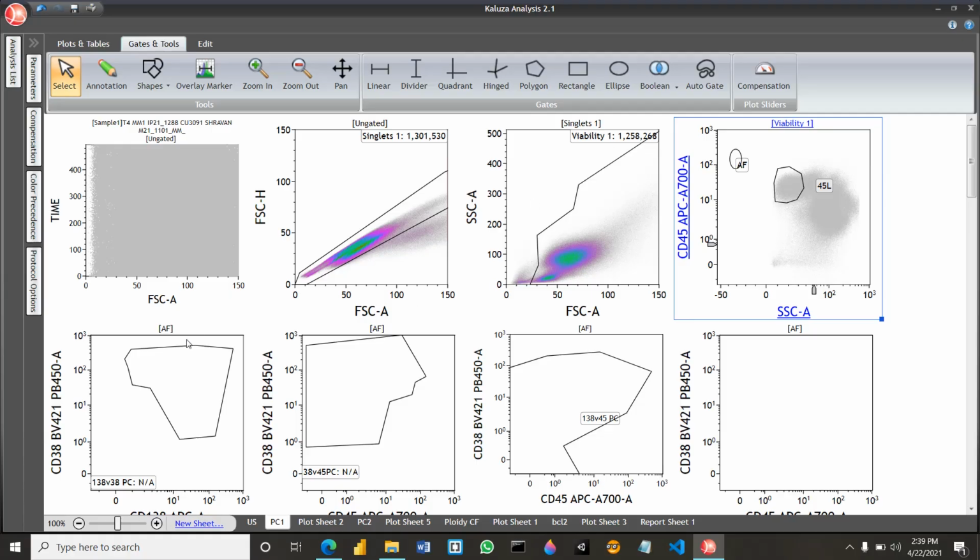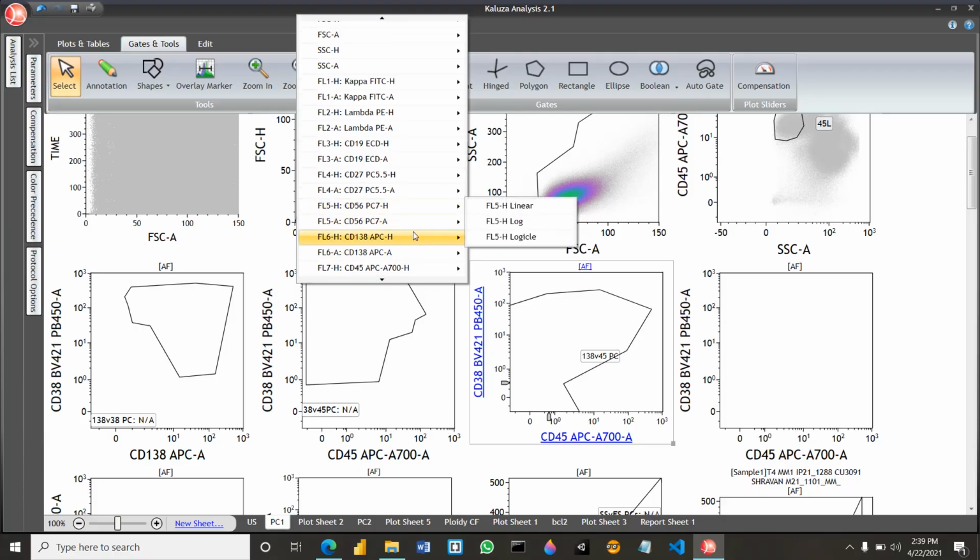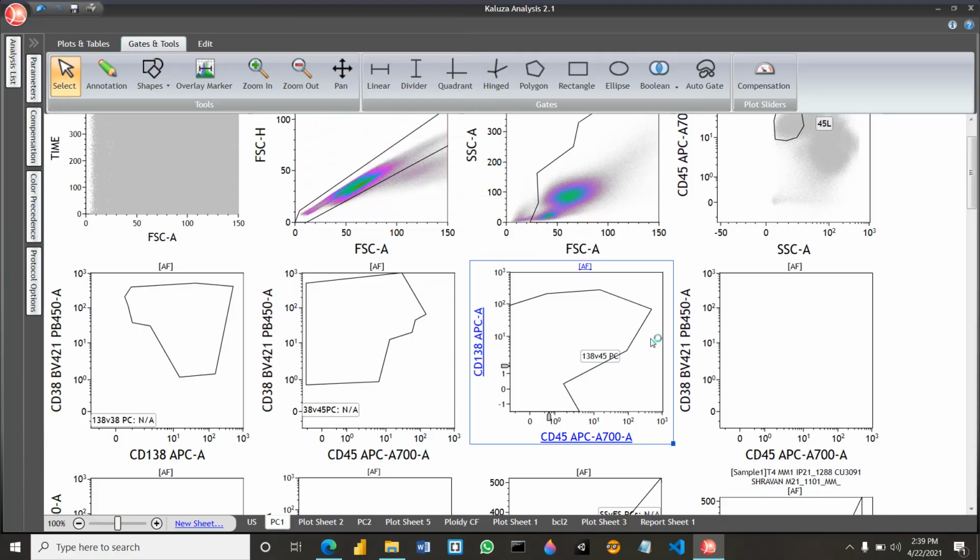As I mentioned earlier, we have two or three combinations to identify plasma cells. We should evaluate using CD38 and CD138. We should evaluate using CD38 and CD45. We can also look at CD138 and CD45. Then finally, one combination covers the maximum cells, and with the other combination we exclude the unwanted debris. We use those two combinations, and then finally get the plasma cells.